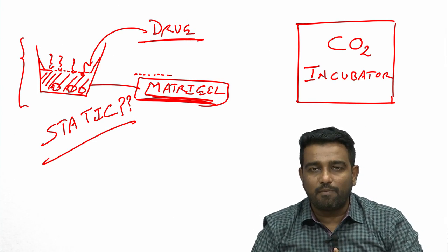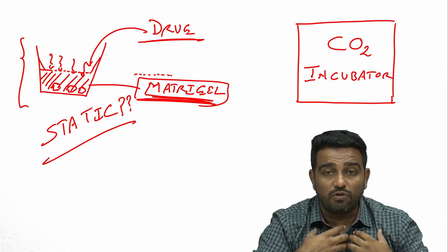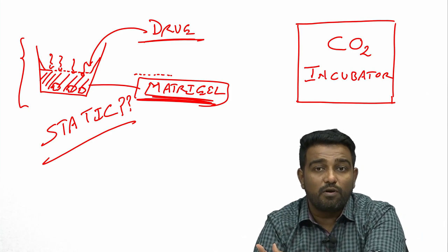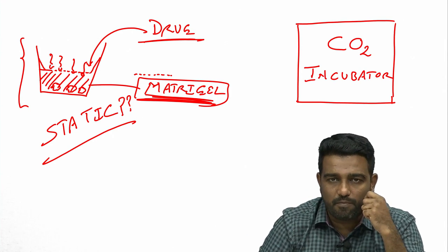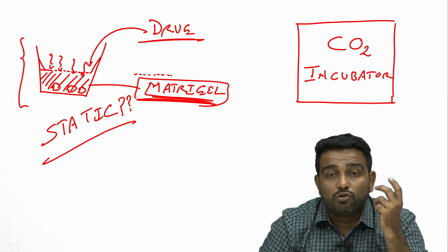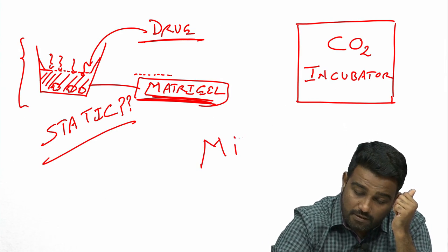So, can we create a platform that can mimic the in vivo situation within the body onto the in vitro? So, this platform is in vitro because it is in the laboratory. Such that it can have the properties of the dynamic model, that is our body. So, what can we do for that? We can develop a microfluidic system.